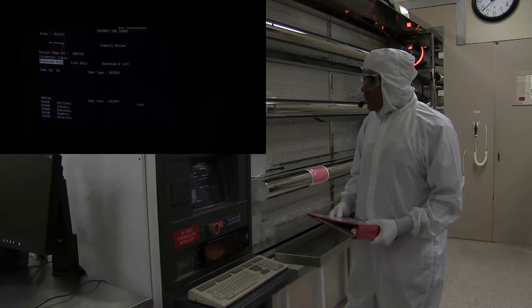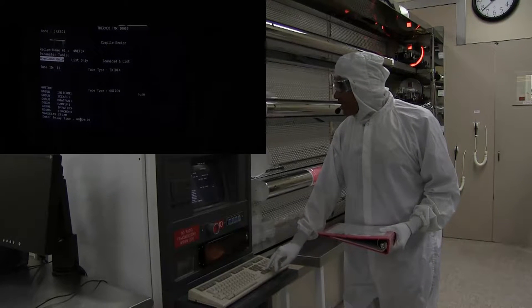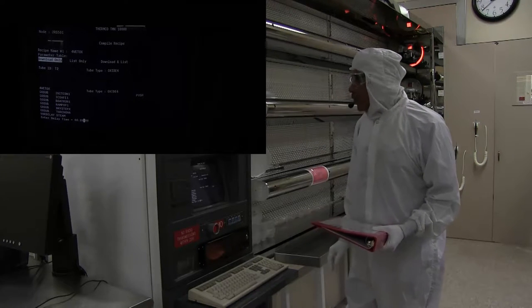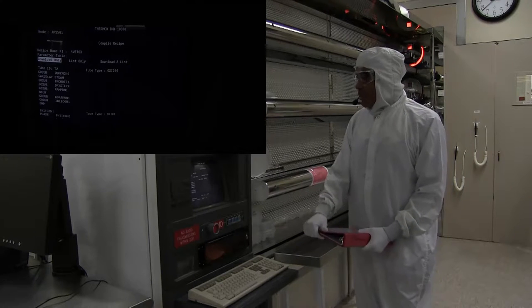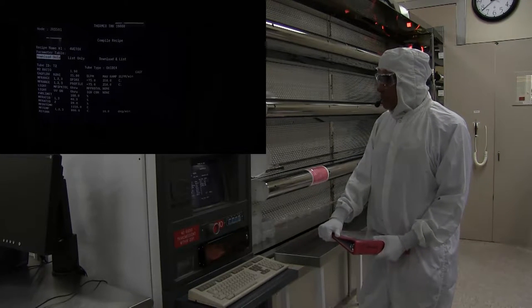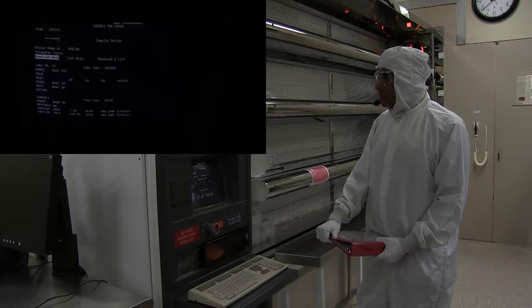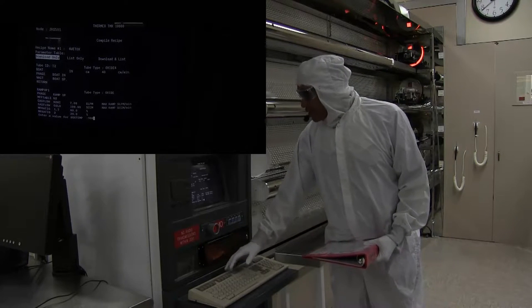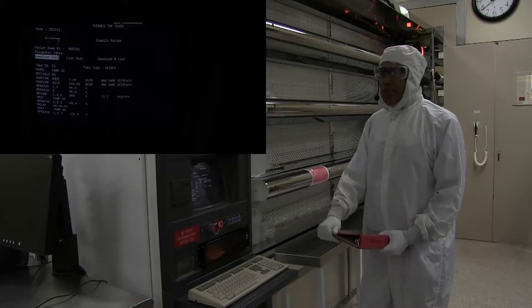It'll come back and ask for the delay time and for the temperature. For this, we're going to put the delay time in for 20 minutes. This is the actual oxidation time or the anneal time. The recipe will continue and it'll come back and ask for the temperature. We're going to put in 900 for our temperature, 900 degrees C. And it'll continue to compile.